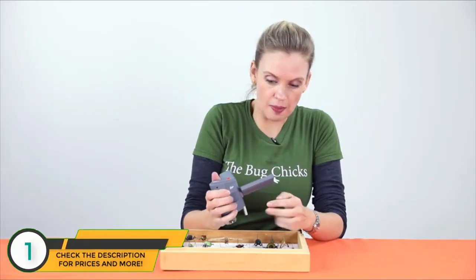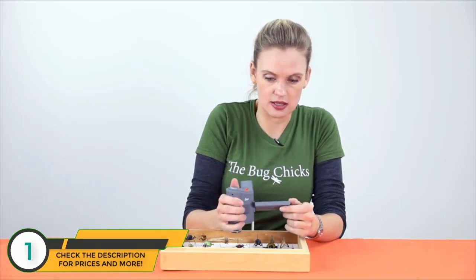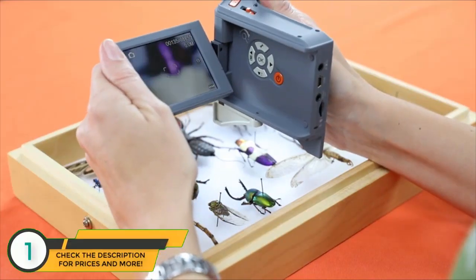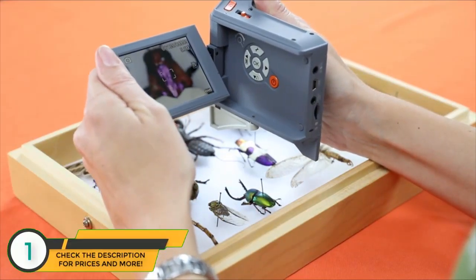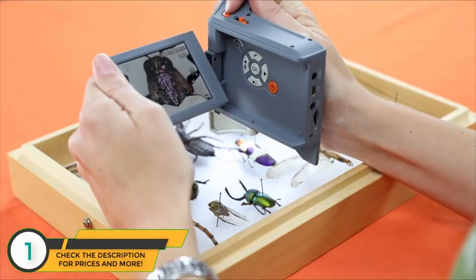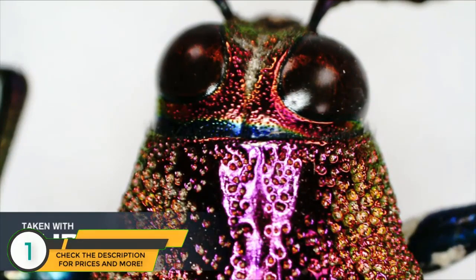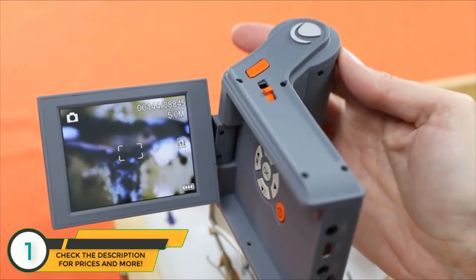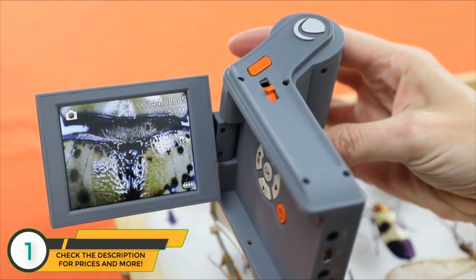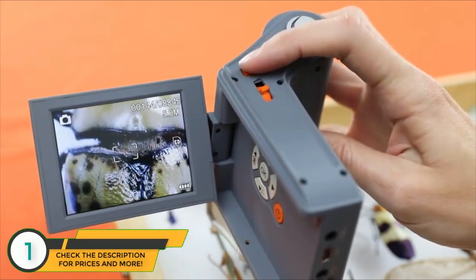I tilt the screen up and point the lights at what I would like to look at. Use the focus toggle, this barrel on the front, boom, and take a great shot. If I want a little bit more light for a darker subject, just use the light on the side. I'm gonna get these hairs on this beetle elytra.